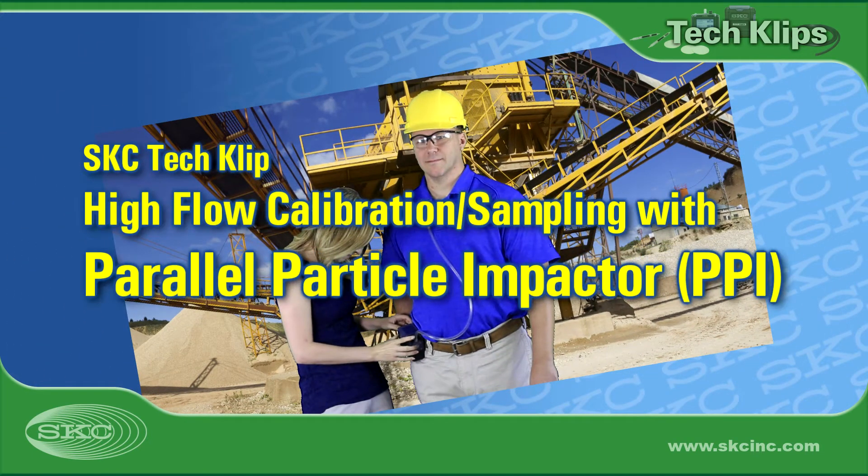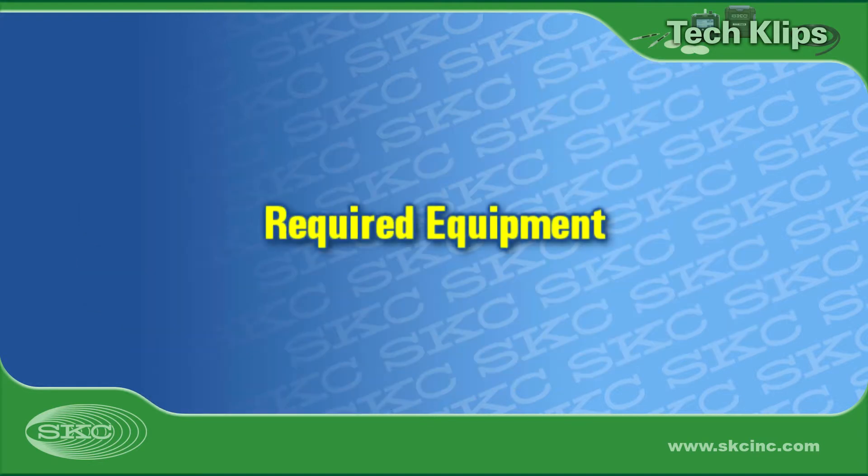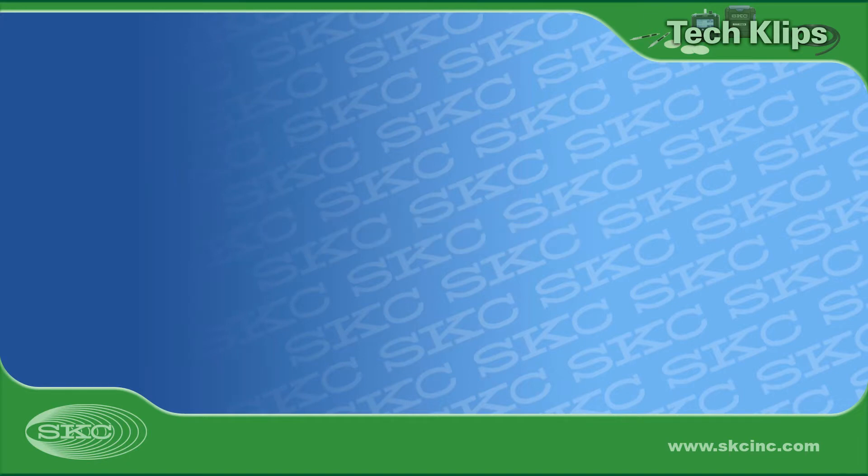Welcome to SKC Tech Clips. Today, we'll show you how to calibrate a sample pump for high-flow sampling with the SKC Parallel Particle Impactor, or PPI. Start by assembling the equipment required for calibration and sampling.